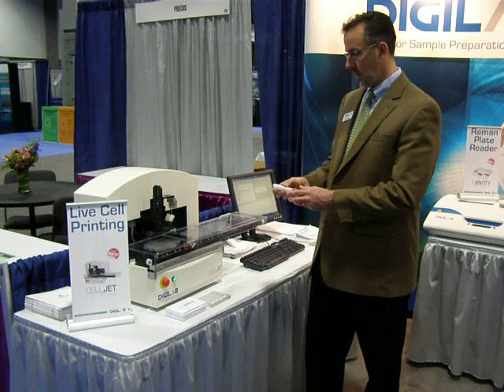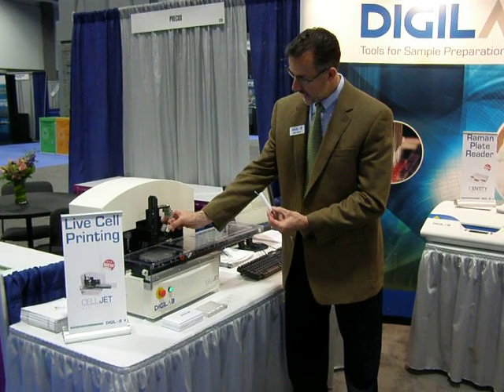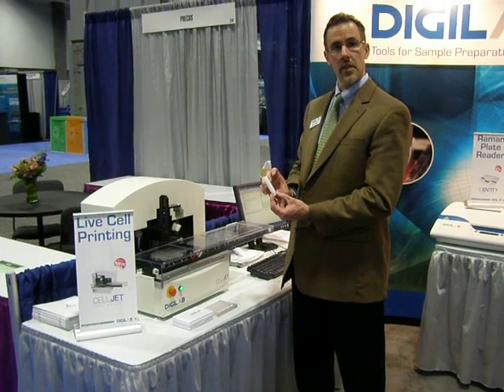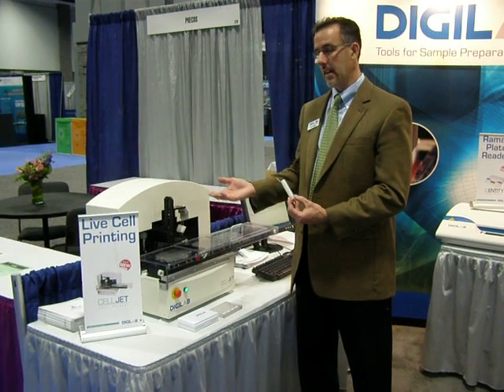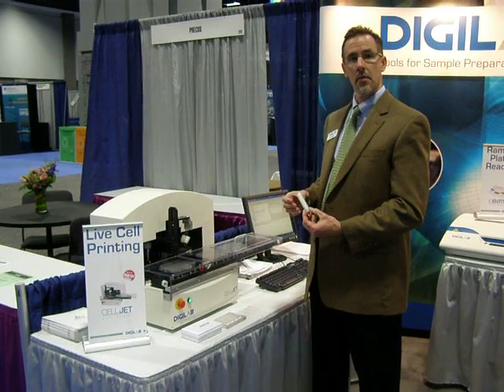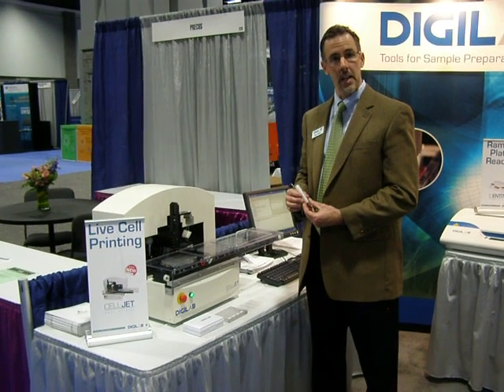One of the key elements that this product features is a coiled loop of tubing, and you can see them on the device here, where we can aspirate cells and keep them in the coiled tubing to preserve them and not damage them, such that they're not heated or that they don't pass through any tortuous mechanisms in the device. This makes the instrument and the technology perfectly suited for live cell printing and tissue engineering applications.